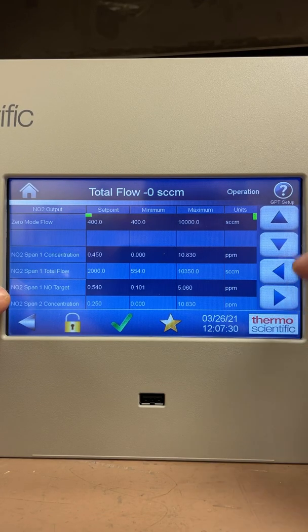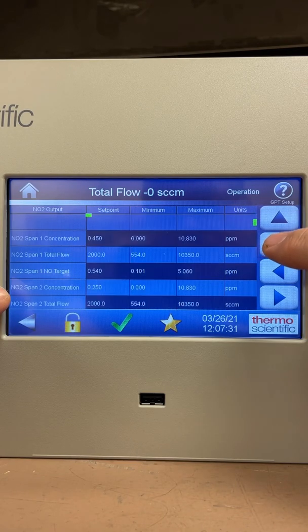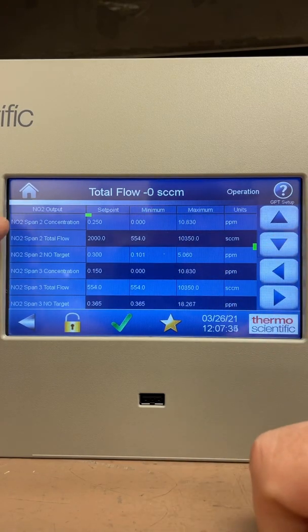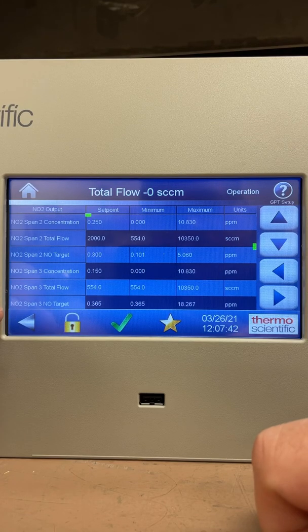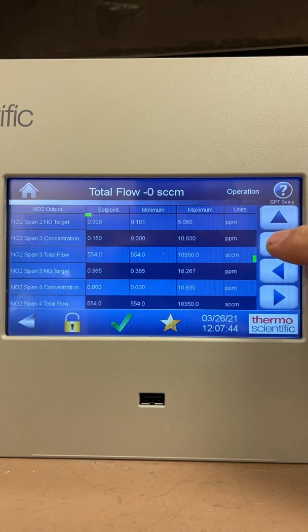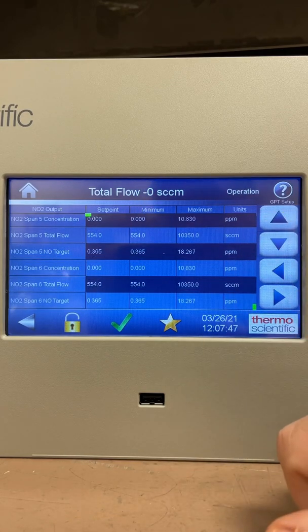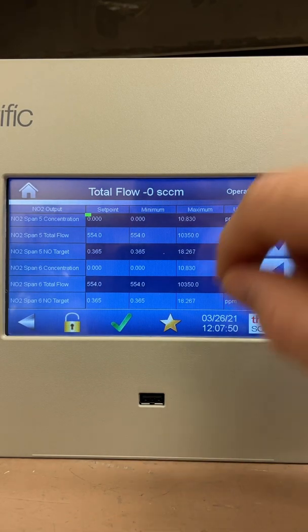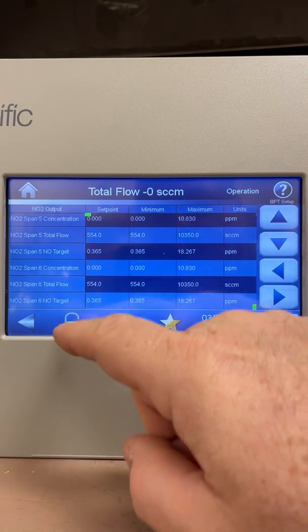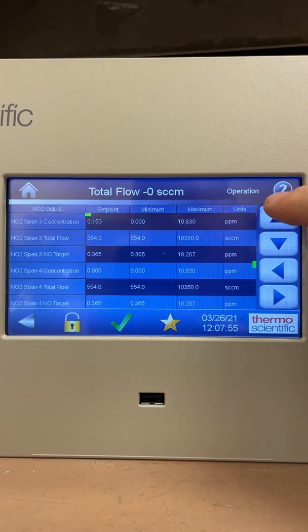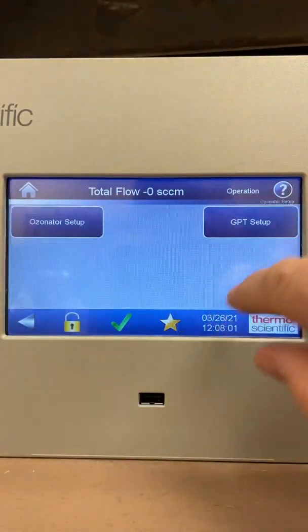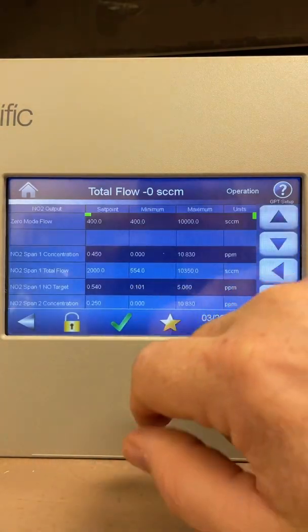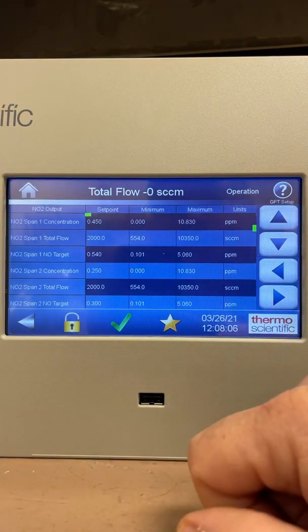For each span you also have span 2 concentration, total flow, and NO target, and span 3 concentration, total flow, and NO target — and this goes all the way down to span 6. You have 6 spans you can configure, each with a concentration, total flow, and NO target setting. This is where you preset all these values before beginning your GPT.